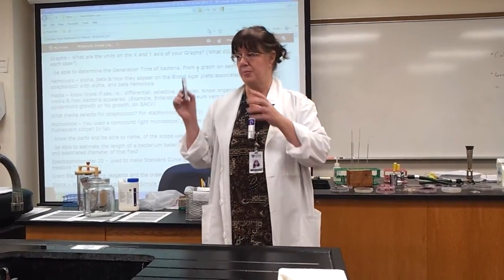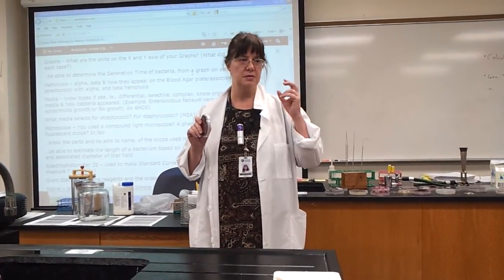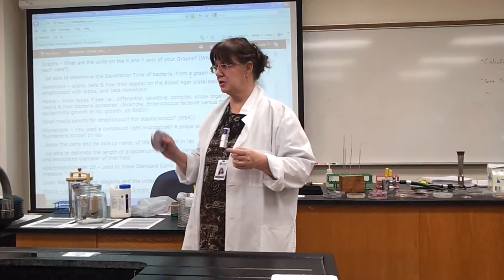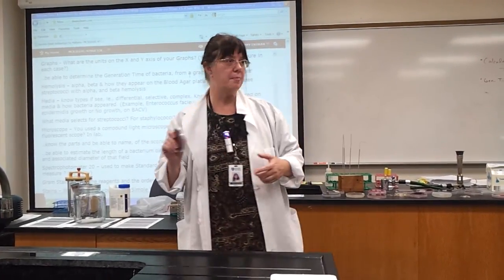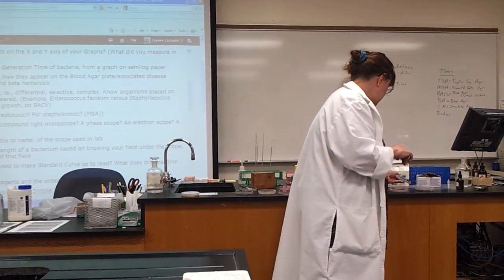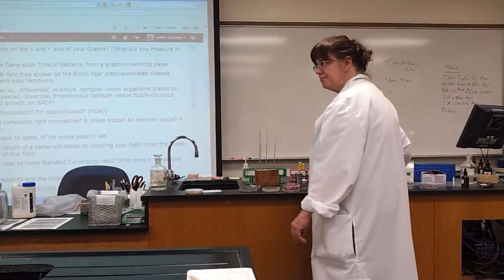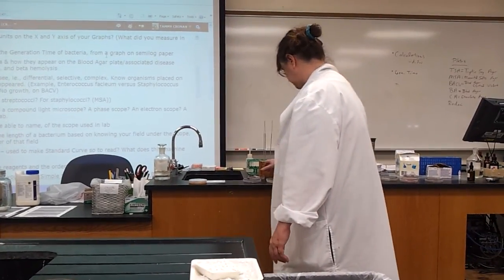Okay? That's only from your throat. From the throat cultures, you would say it stops the growth of staph, allows the growth of strep. Does any strep turn royal blue? Any strep. Any strep will turn royal blue.